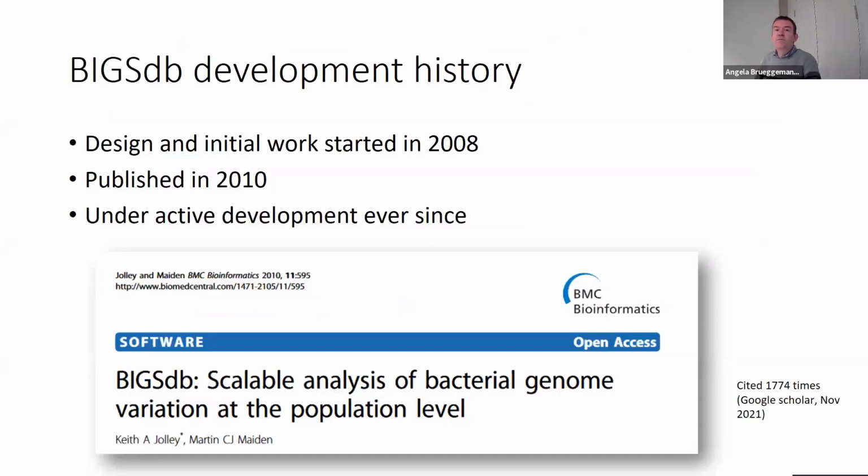And then if we look back to when we actually started doing this, the design and initial work for BIGSdb started back in 2008. So it's had quite a long history of development. And actually 2008 was before we actually got genome sequences.